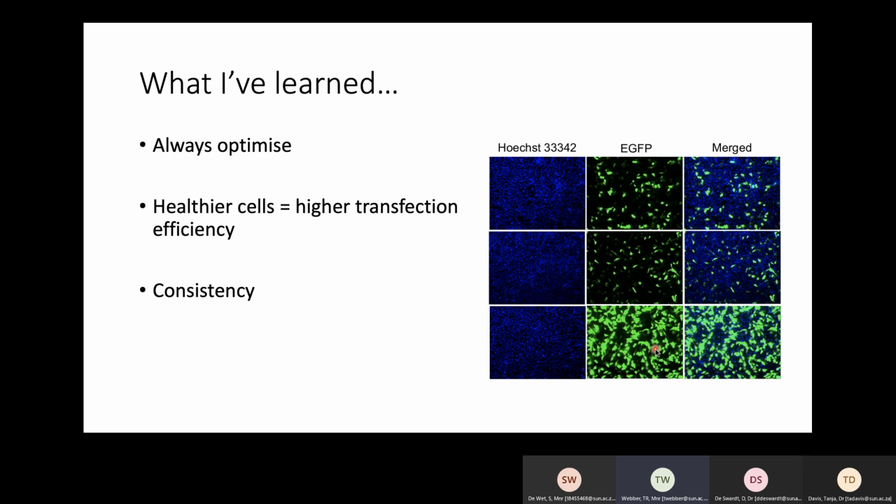So what other groups within the department do is they just incubate the siRNA with their cells for a certain time, and they get good enough transfection. So that's kind of passive, without any vector. Have you got any experience with that, and is it advisable?